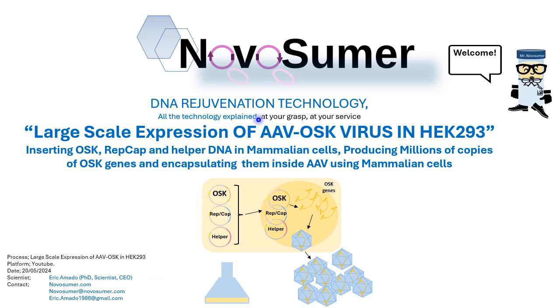Welcome back to another session, the sixth video of DNA rejuvenating technology. All the technology explained at your grasp, at your service. And today's topic is large scale expression of AAV-OSK virus in HEK293, the mammalian cells, this kind of specific cells that we are going to use. And what does it mean?